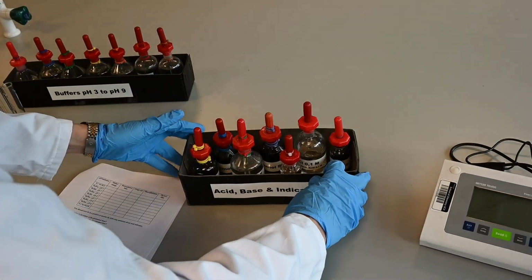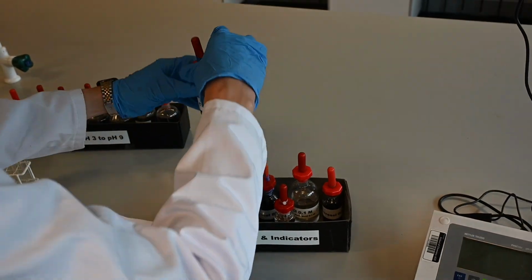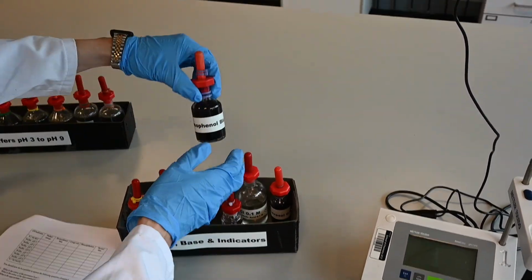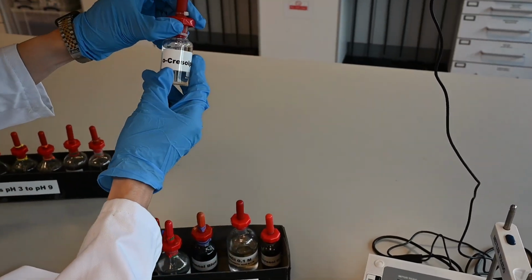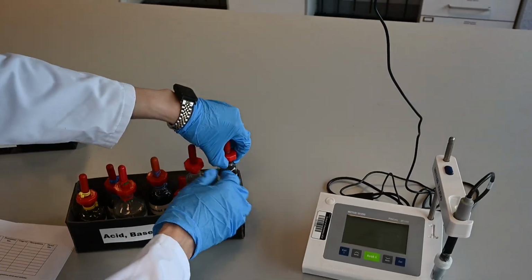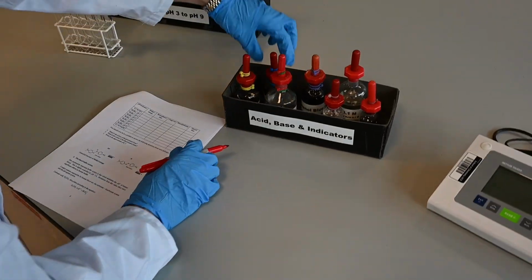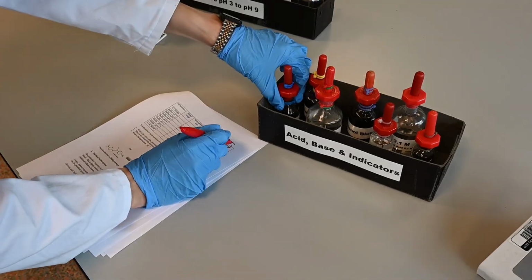Our indicators today: we have nitrazine, thymol blue, bromophenol blue, o-cresolphthalein, and bromocresol green. So these are the indicators. Okay, so we try one. Maybe thymol blue. Okay, shall we? Yeah, thymol blue.